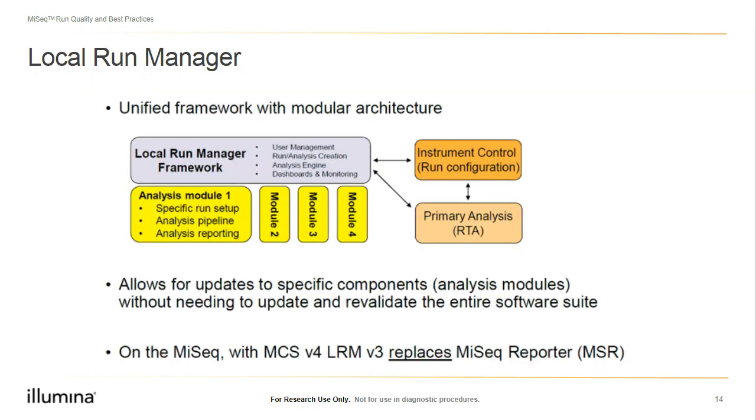I wanted to quickly take a second to cover Local Run Manager itself, which, as mentioned here, is a unified framework with modular architecture. So what does that mean? Local Run Manager is a software that is installed on your computer or your instrument computer and runs independently of the control software as well as the RTA primary analysis software. The modular aspect of it means that we're able to download and install various modules into the software, and that allows us to update specific components without having to update and revalidate the entire software suite.